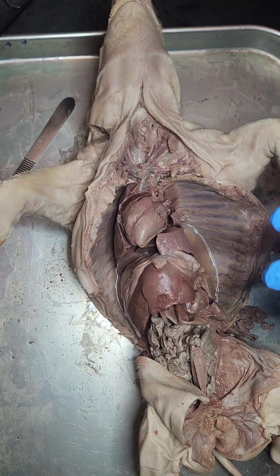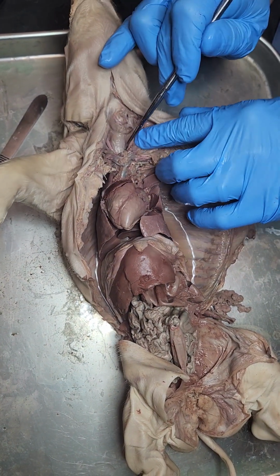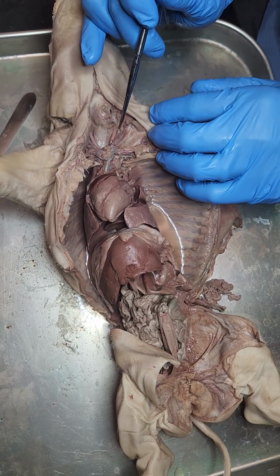We don't do thyroid, so we can skip thyroid. Nine is trachea. And trachea is this windpipe right here. Okay. You can see that it sort of makes a little rigid noise.